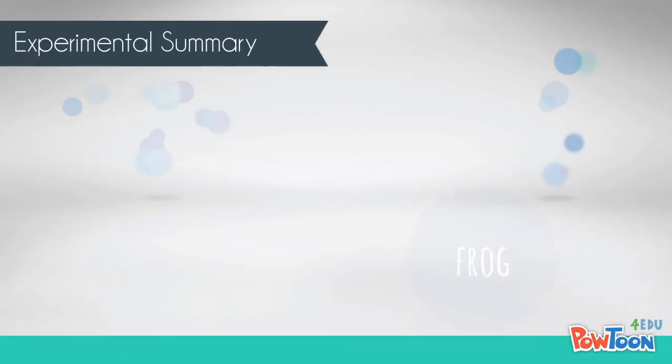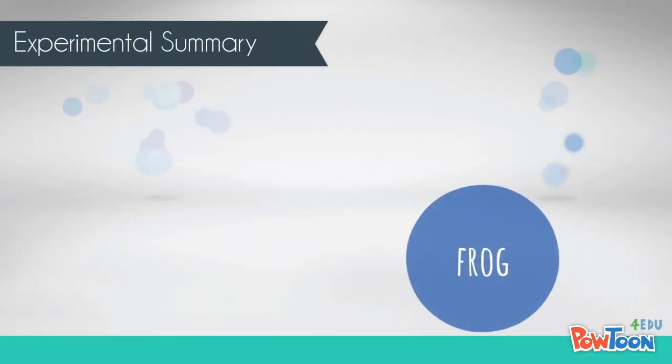In this experiment, a frog sciatic nerve preparation was used to study the physiology of neural compound action potentials in response to variable temperature. The results of these experiments demonstrate that the neurophysiology in frogs is a useful means of studying concepts related to other species. However, the range of temperatures used in this experiment demonstrates the physiological significance of temperature within different species. The results indicate that temperature significantly influences neural function at extreme temperatures.